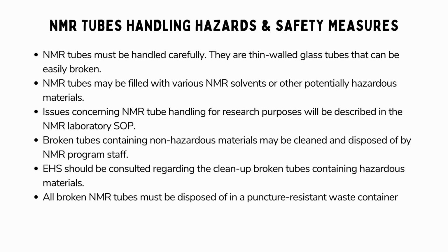Handling and safety of NMR tubes. Handle NMR tubes with utmost care as they are fragile and prone to breaking. Be aware that NMR tubes can contain a variety of solvents or materials, some of which may be hazardous. Detailed handling procedures for NMR tubes in research are outlined in the Laboratory Standard Operating Procedures, SOP.